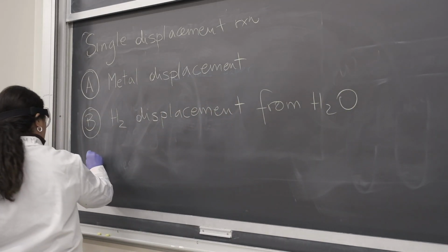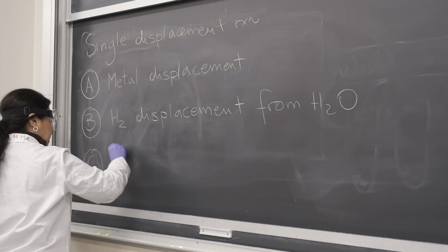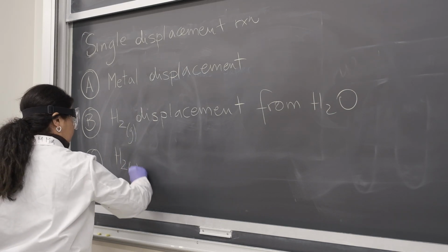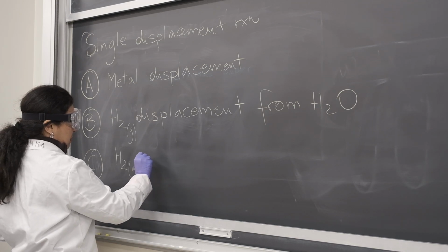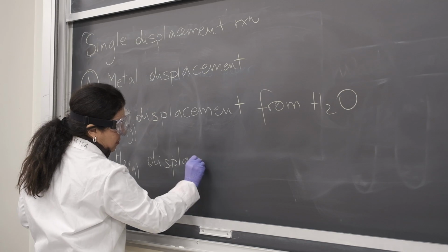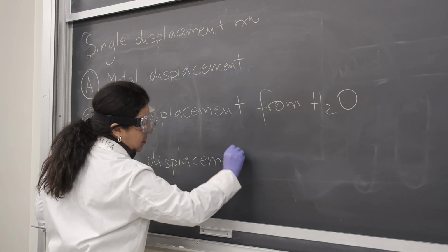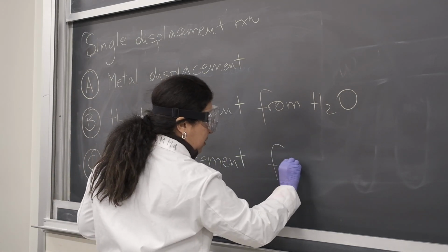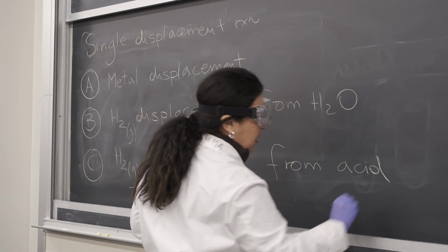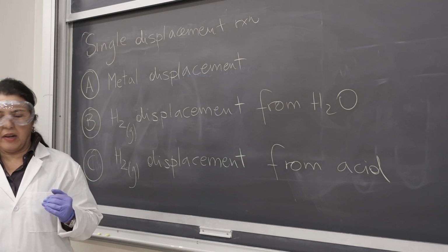And then we can have hydrogen displacement as a gas from acid. That's what we said earlier at the beginning of the lab.